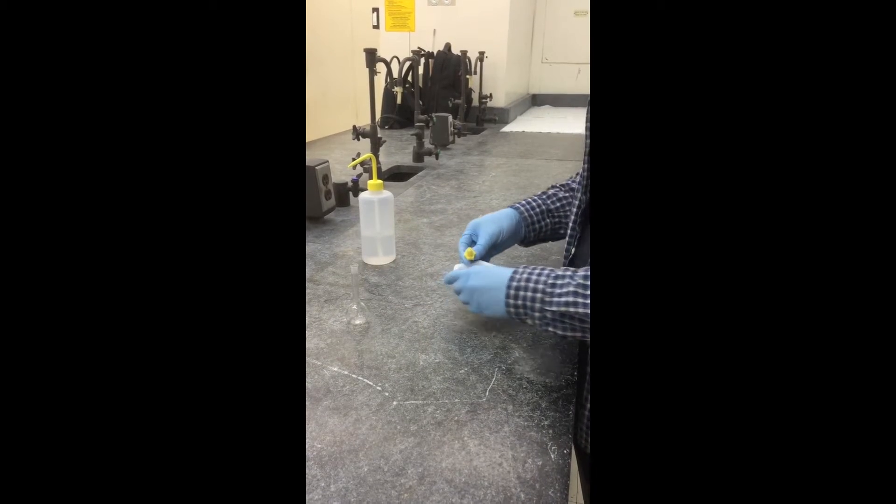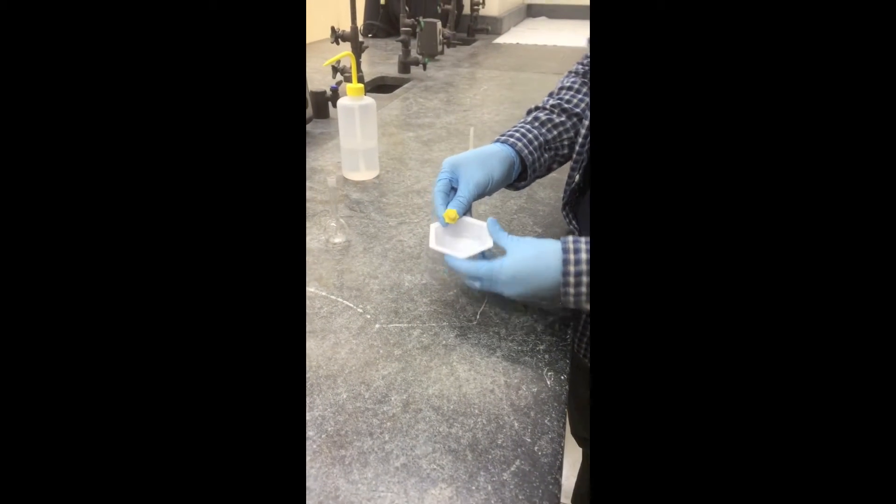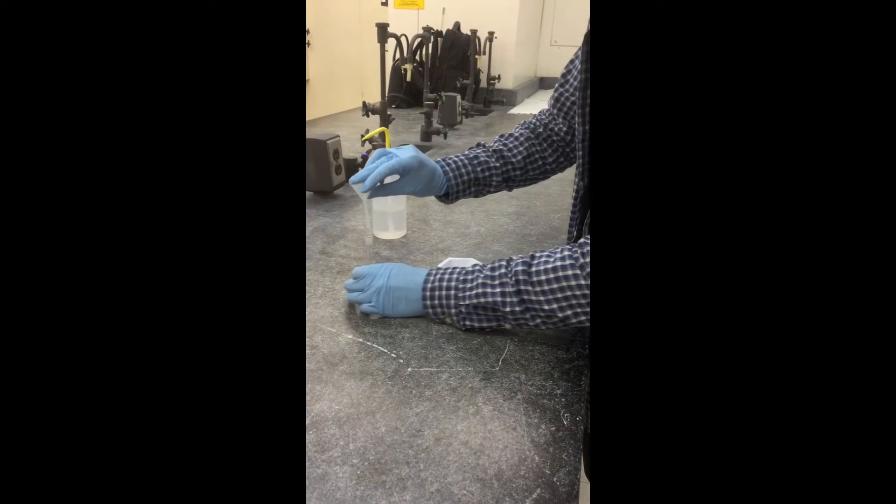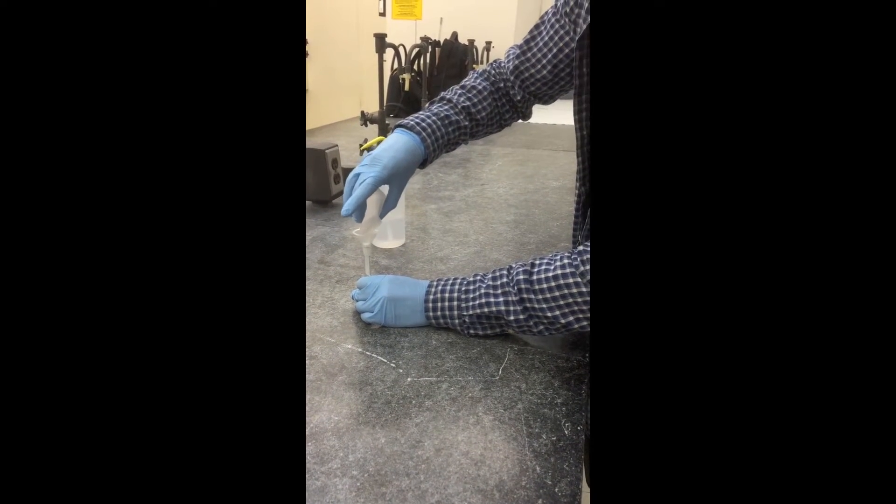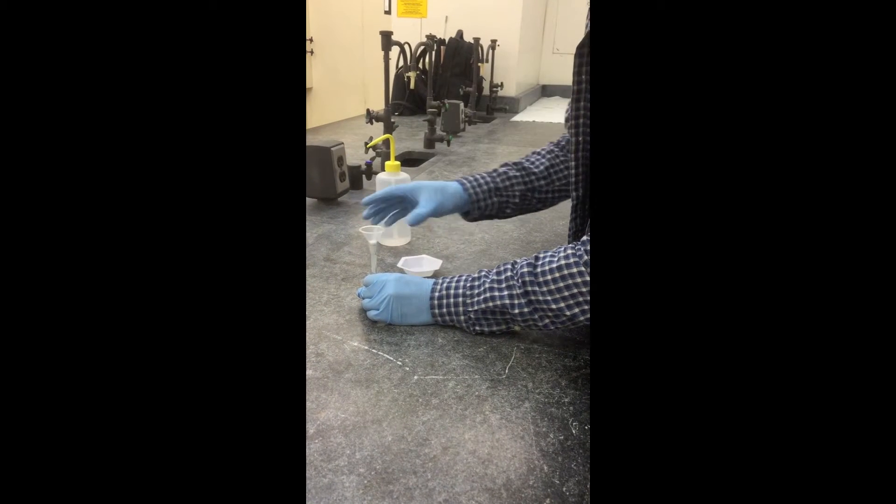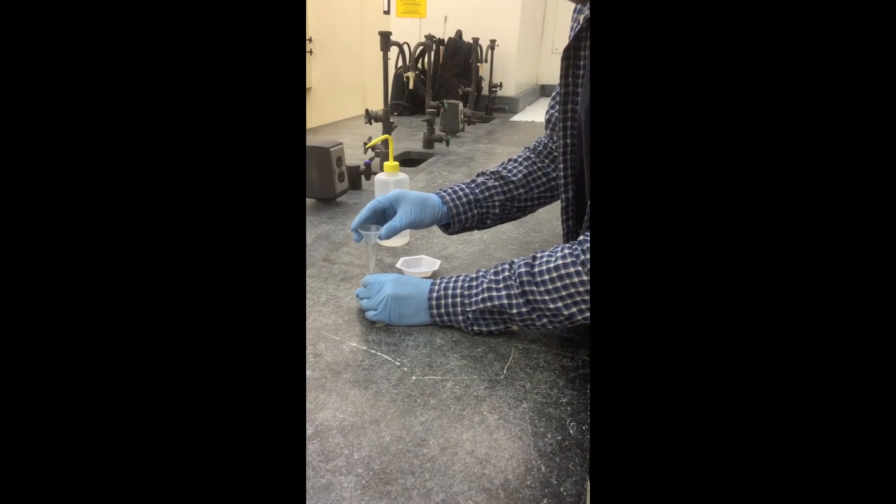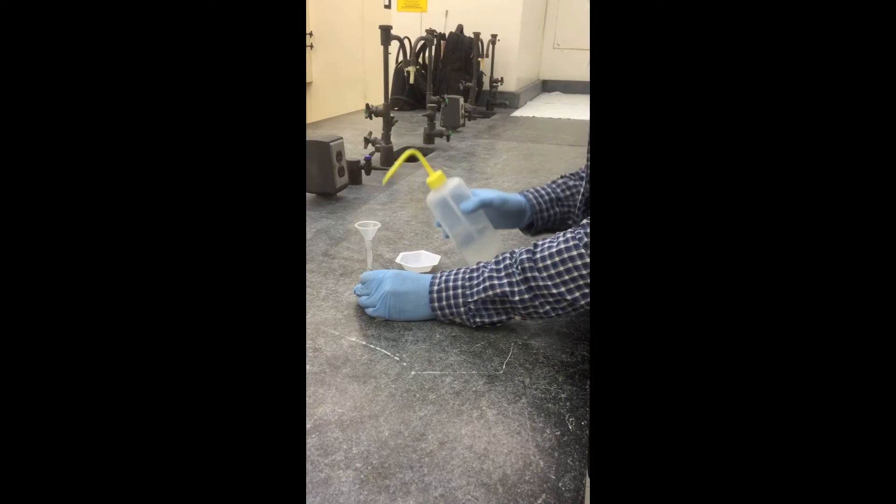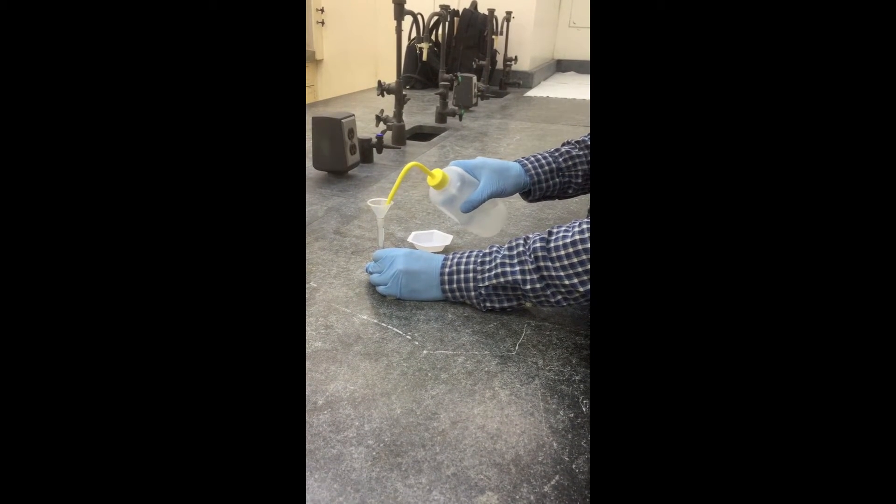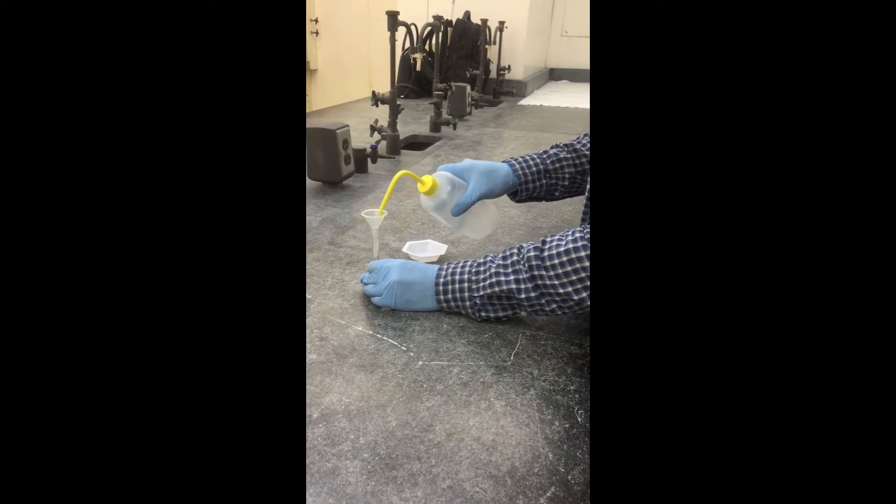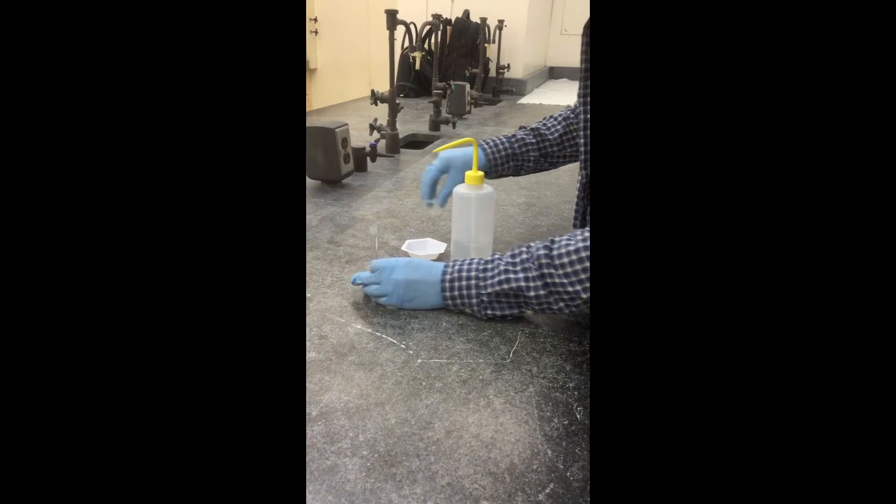Take your volumetric flask and remove the stopper. Use a funnel to add the solid. Dissolve the solid using deionized water and fill close to the volumetric marking.